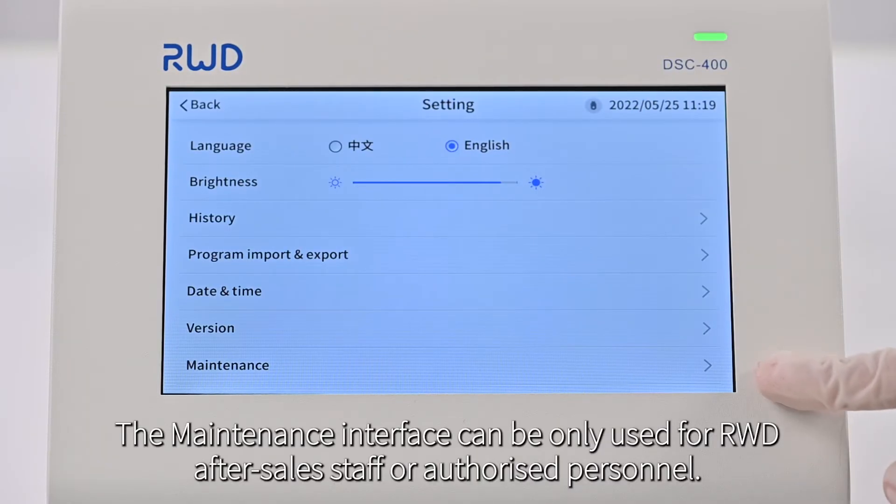The maintenance interface can only be used by after-sales staff or authorized personnel.